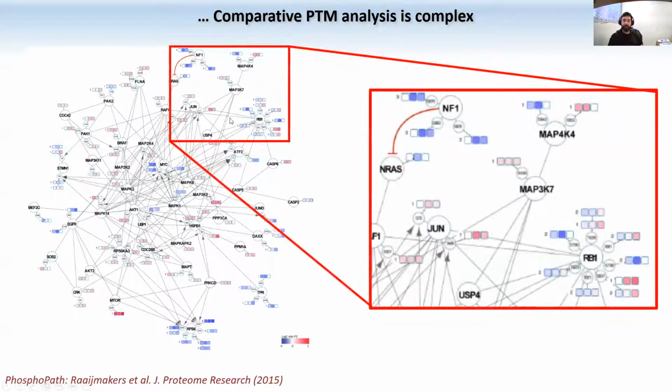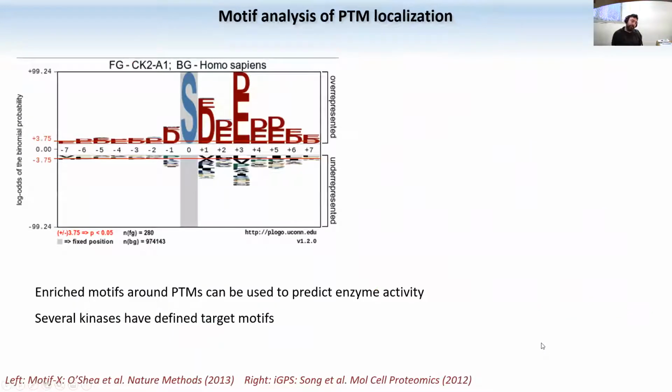If you zoom in, you see that you can have some proteins that have multiple phosphorylations, and then they can be differentially regulated in different samples, right? So for example, this is a specific phosphorylation that is down-regulated in the second sample, not regulated in the third sample, for example. And so, like I told you, it becomes really tricky because it's not enough to know the function of the protein. You need to know what is the function of this phosphorylation compared to this one, for example.